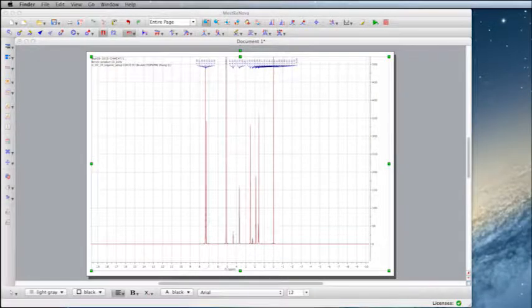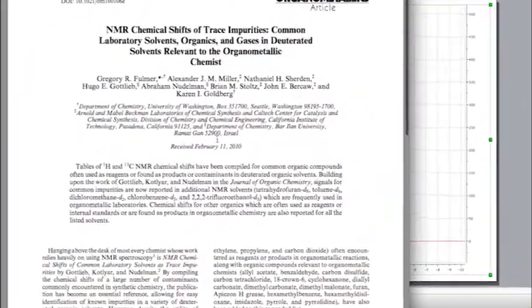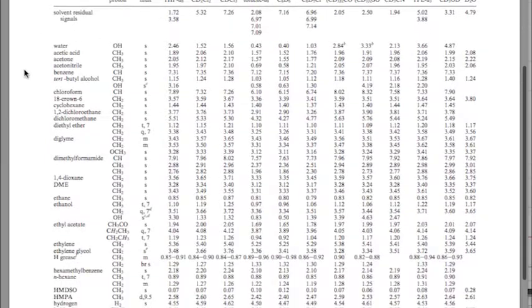While analyzing your NMR spectra, it is important for you to consider possible sources of protons that can produce a signal before doing the integrations and peak assignments for the protons in your compound. Solvents used in your reaction and purification procedure, such as methanol, ethanol, and water, as well as impurities including grease, can all produce unique signals.